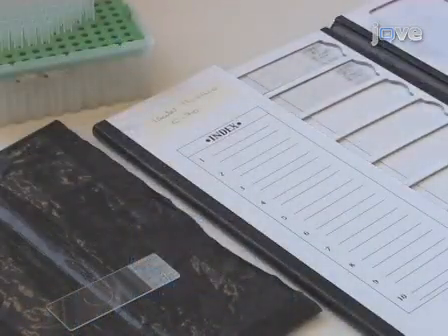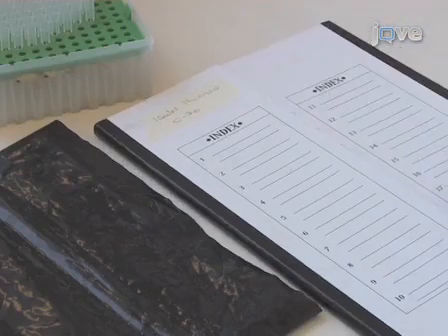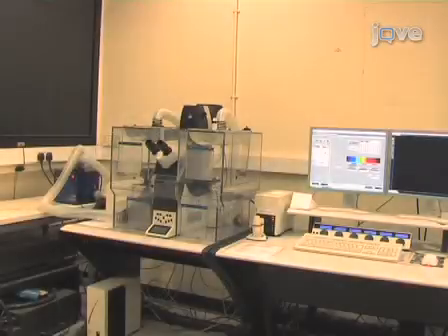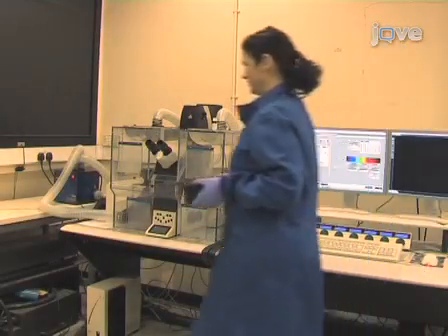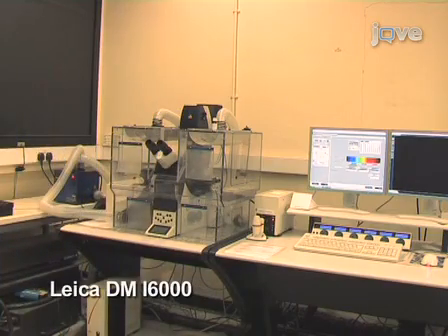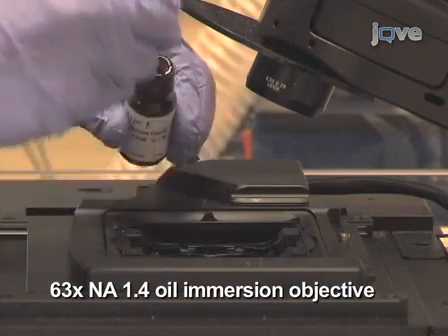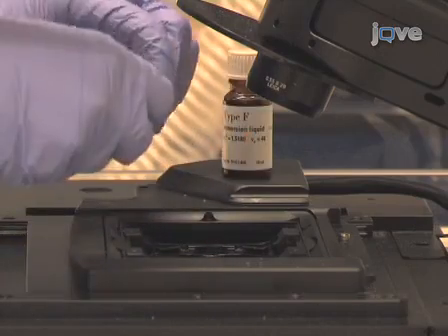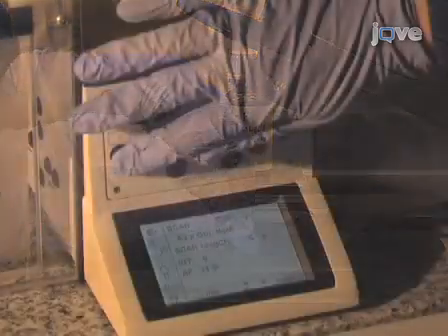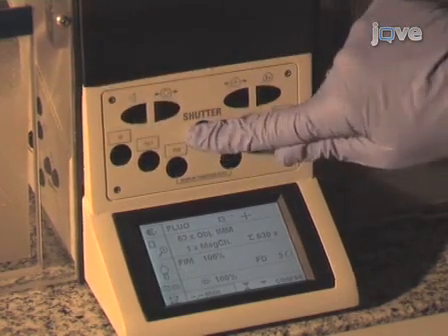Mounted cover slips should be stored in the dark until they are ready for observation under the microscope. We observe and capture images of our immunolabeled samples using a confocal laser scanning microscope attached to an inverted epifluorescence microscope. To begin the CLSM procedure, add a drop of immersion oil to the objective and place the specimen slide, cover slip down, on the microscope stage.